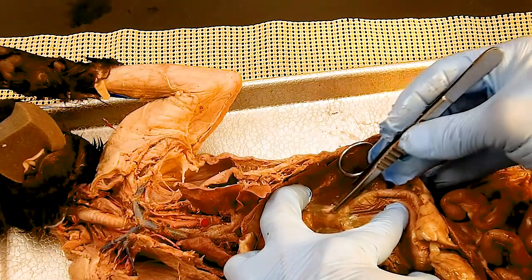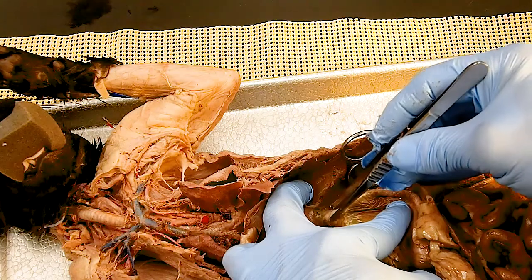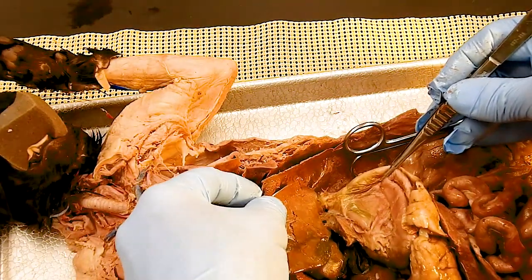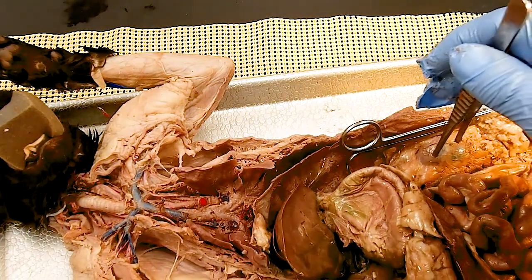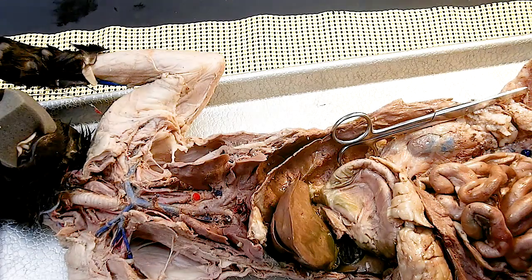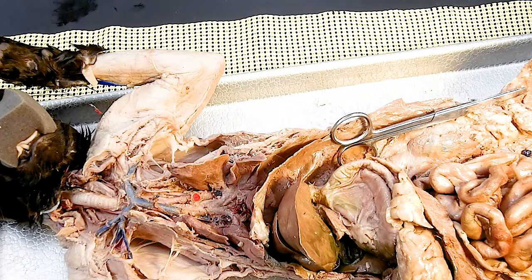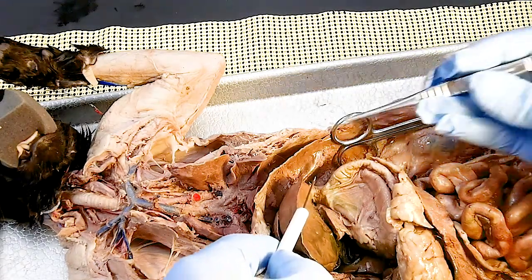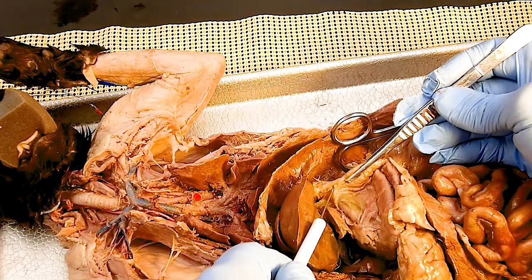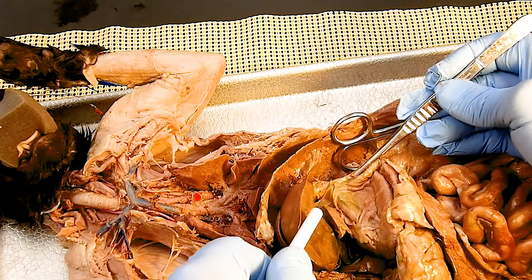If I can clear it a little bit. There is the esophagus going into the stomach. So there's that valve we talked about. Move my light a little bit. There's a valve between the esophagus and the stomach. So right here, gastroesophageal valve or cardiac valve is right here.